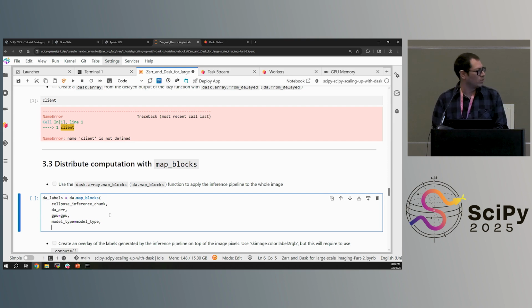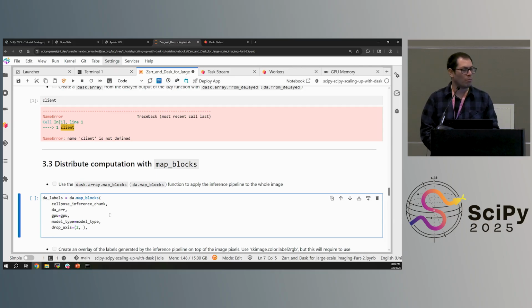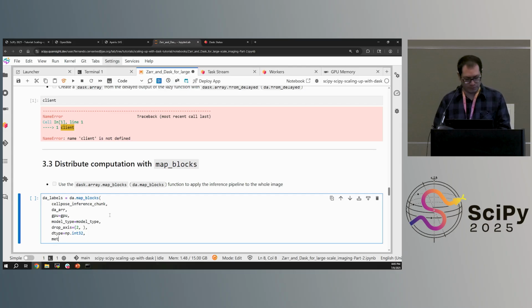So imgt is transforms. This is the library that we pulled from Cellpose. We have this convert image function, and we're going to use this now directly on computing our selection. So our selection, we need to convert that into a NumPy array with compute. We need to tell it where is the channel axis in that array. It is the second index in the axis, so 0, 1, 2.